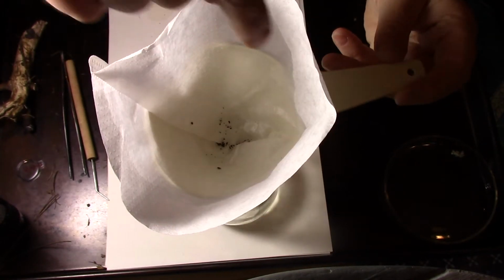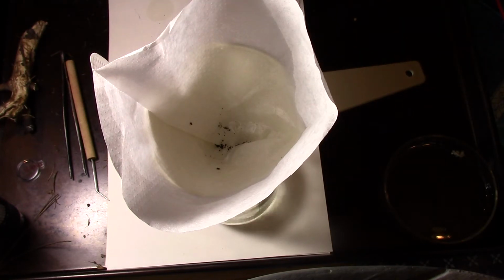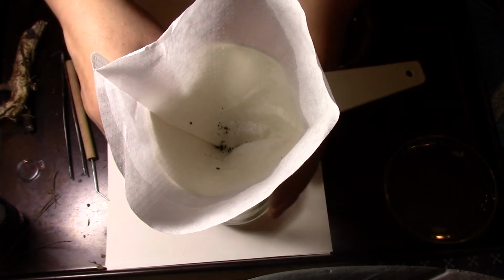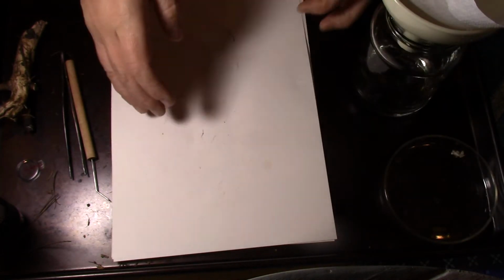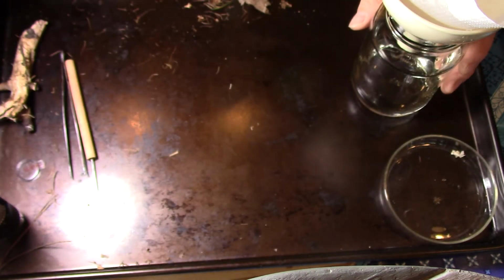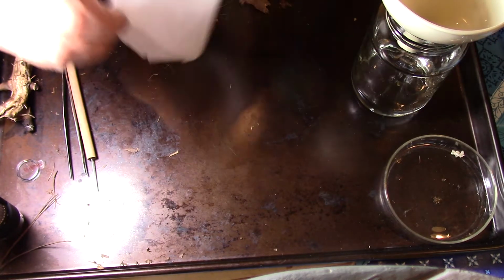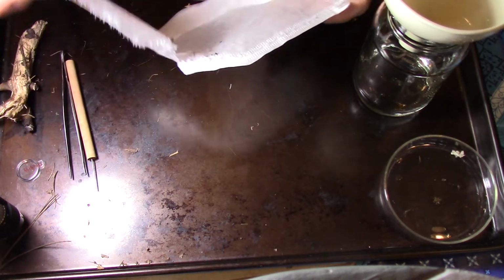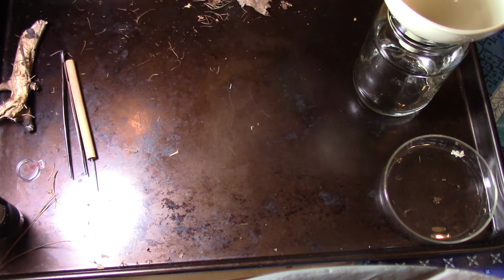And you can see all of the little critters. Maybe it's just all dirt. I'm hoping there's some little critters that are the mesofauna that I never would have picked out of the hand sorting option. So I think I don't need this white paper at the moment because the coffee filter will be the paper. I'm going to rip this open. No, I'm going to need the white paper. Because that didn't work quite as I anticipated.